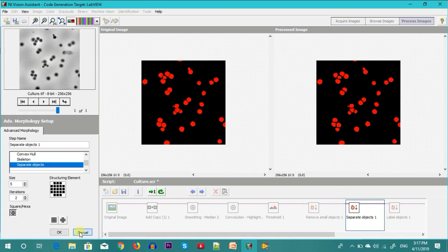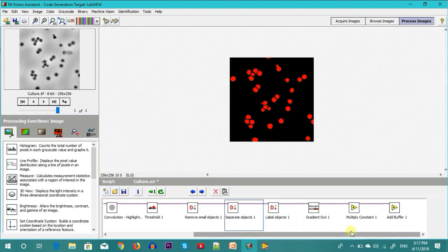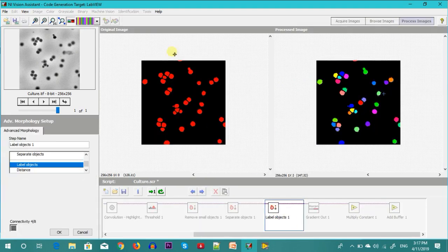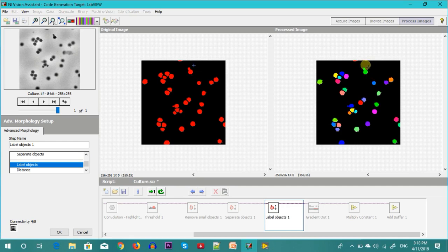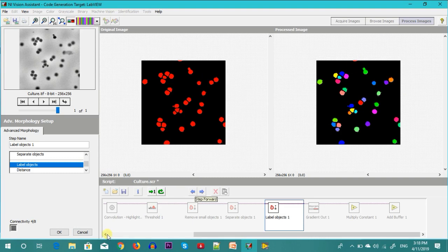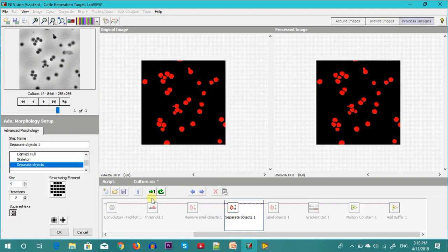Then we do labeling. Labeling allows us to see whether two particles which are conjoint have been separated properly. In this case these conjoint particles have not been separated, but over here this conjoint particle has been separated using the separate object operation. If you still want to separate the remaining ones, you have to go back and change the parameters — maybe increase the iterations.